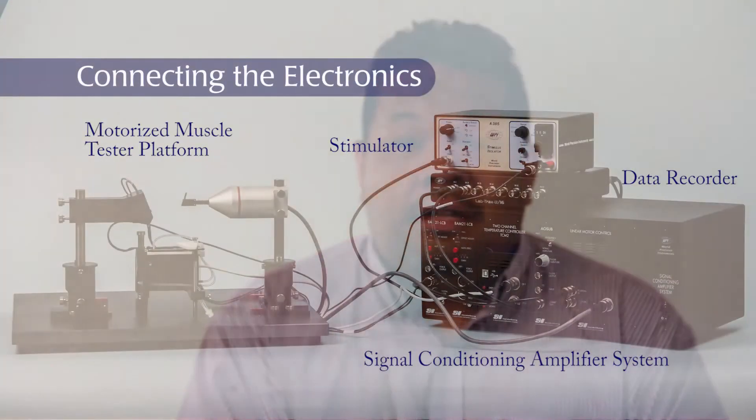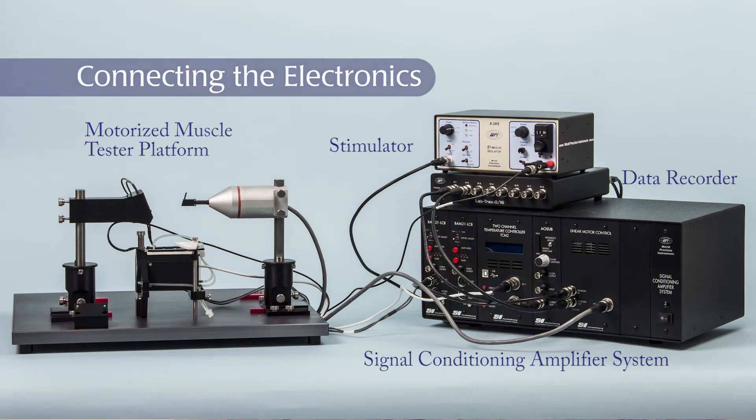Hi, this is Gabriel Gonzalez with another WPI technique. Today we will be discussing how to set up your signal condition amplifier module for your muscle tester platform.